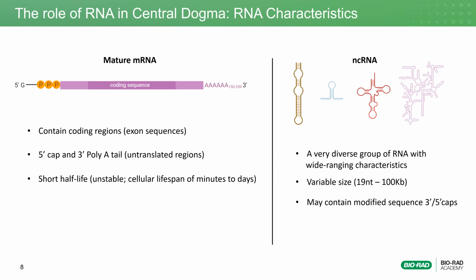Although a few non-coding RNA classes contain modified sequences, most do not contain the 5' or 3' processing caps that mRNA contain. Similar to mRNA, non-coding RNAs also represent an extremely unstable group of molecules, so extra precautions are taken when handling these in the laboratory as well.